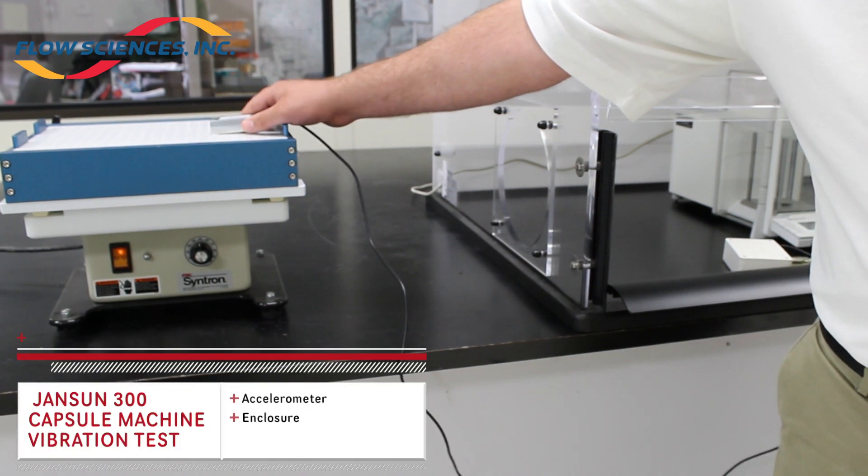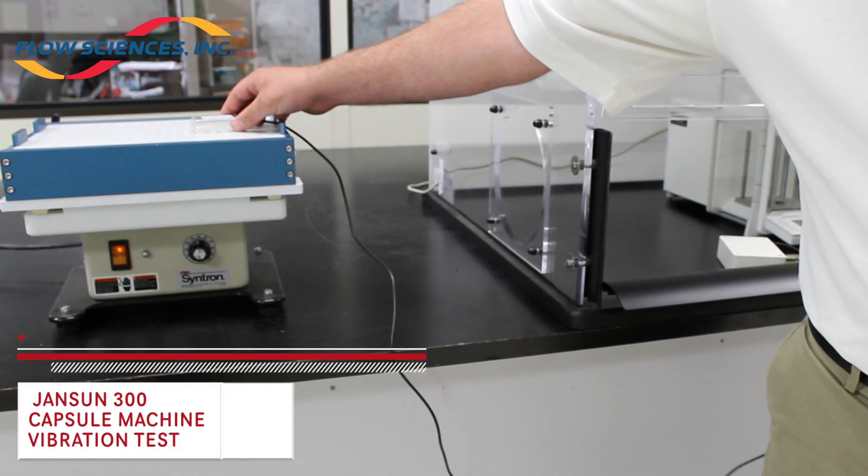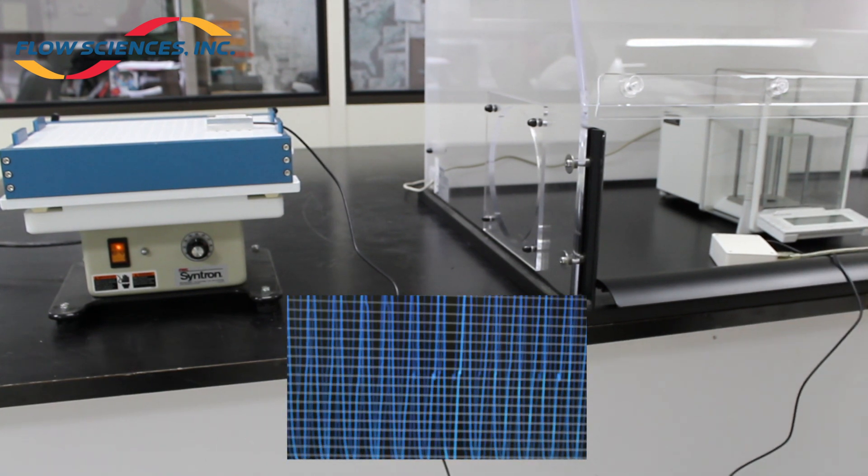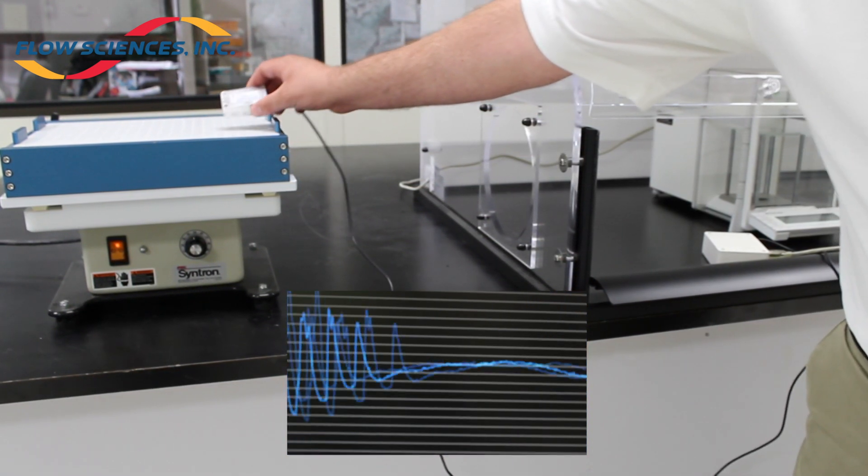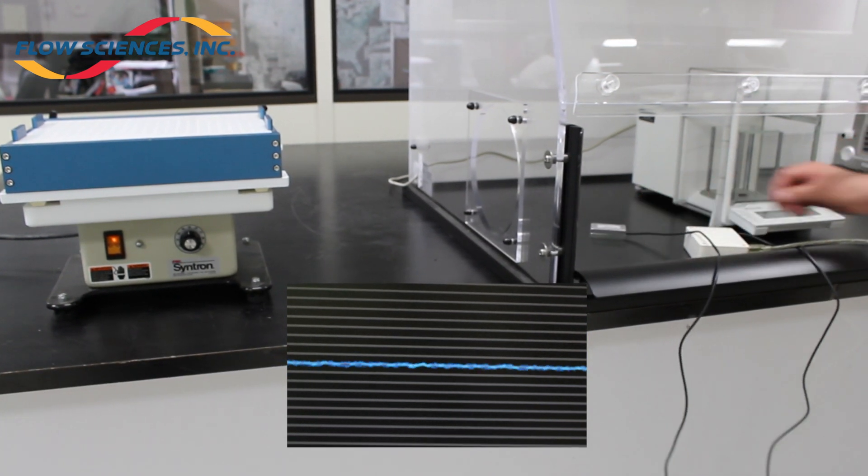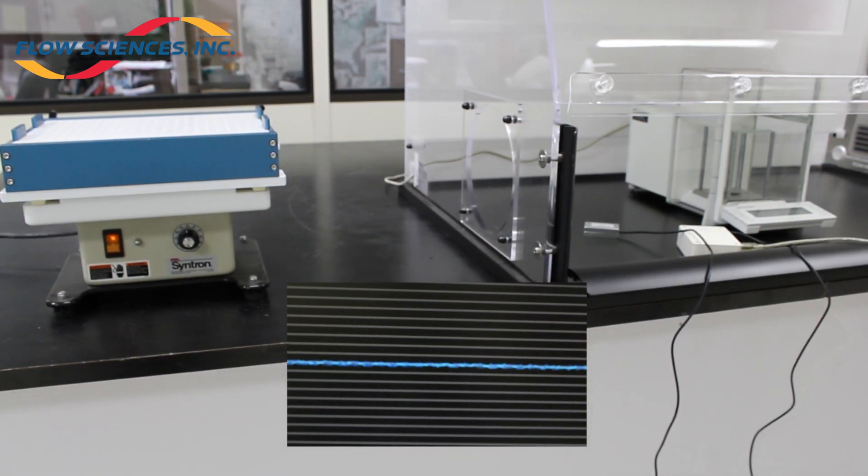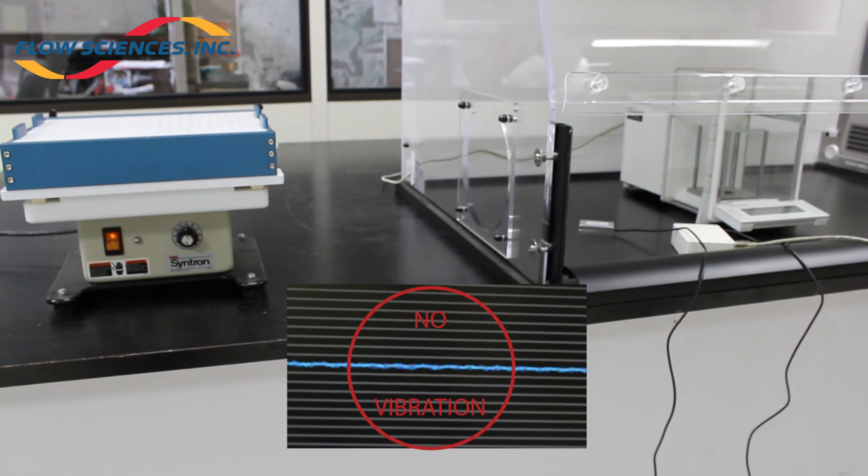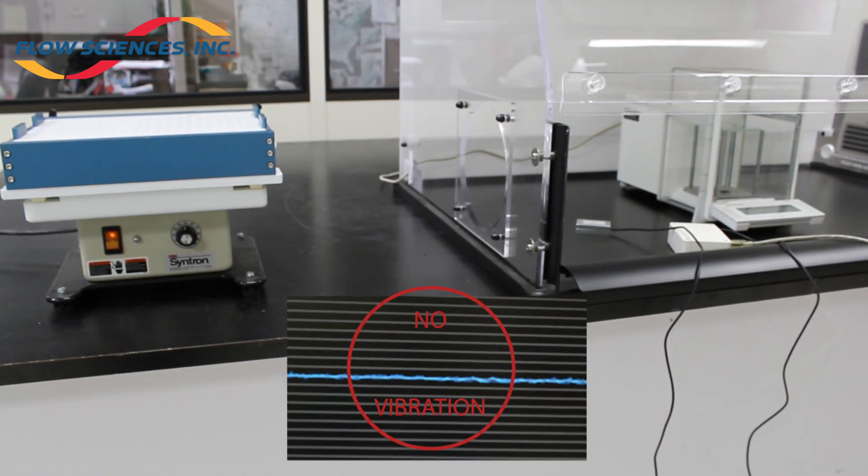Test 8: A Jansun 300 count capsule machine at approximately 50% power was used for an example of a machine that creates vibration to determine a baseline reading for actual G force. We then moved the sensor into the enclosure to determine if the vibration from the machine would transfer onto the phenolic work surface.